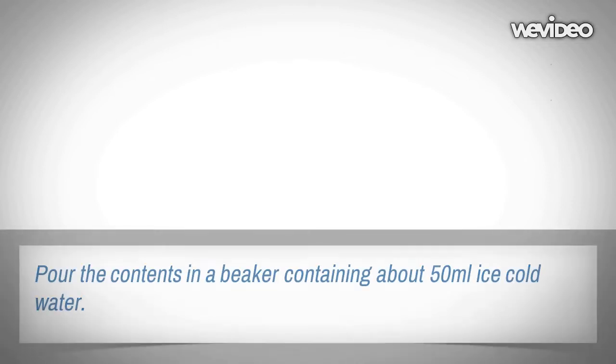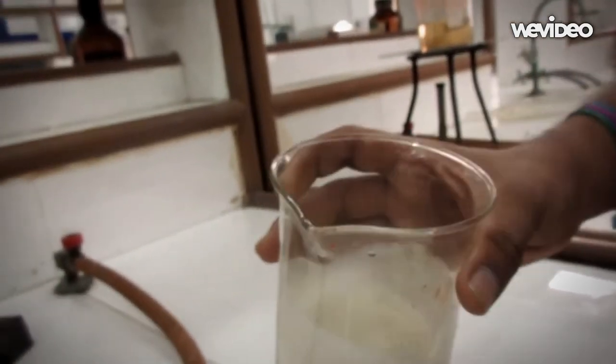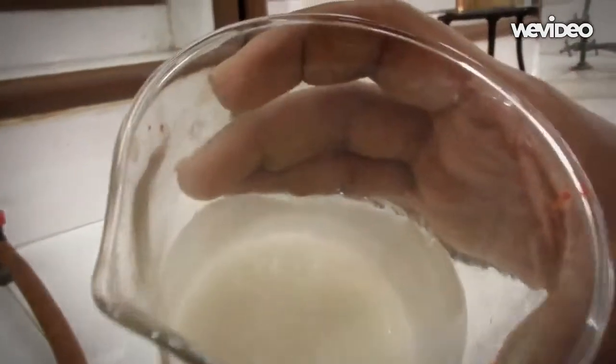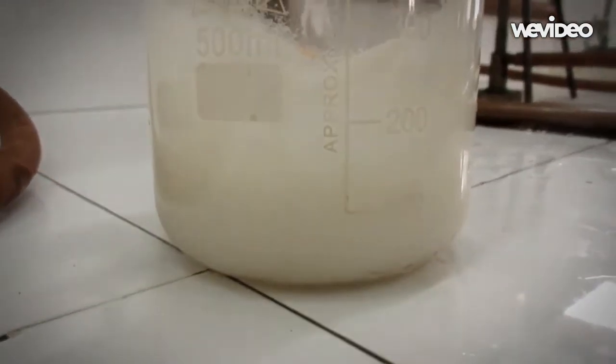Heat this test tube in a water bath for about 20 minutes. After cooling down to room temperature, add the contents in the beaker containing 50 milliliters ice-cold water. Shake it and the precipitate of acetanilide is obtained.